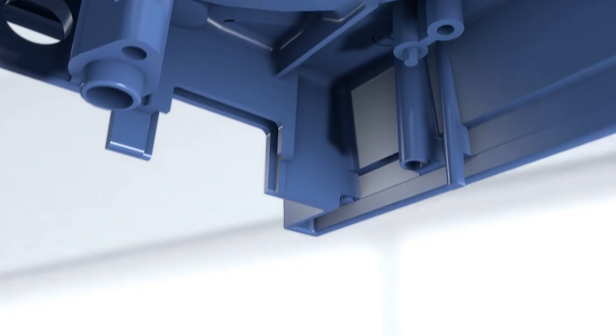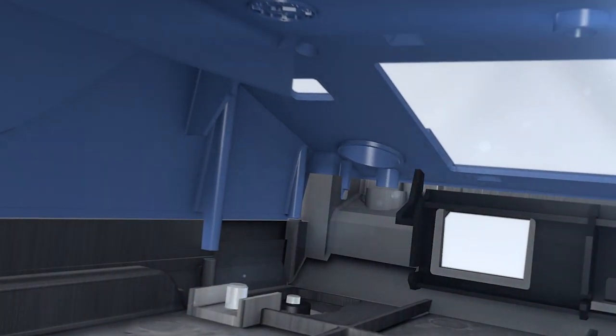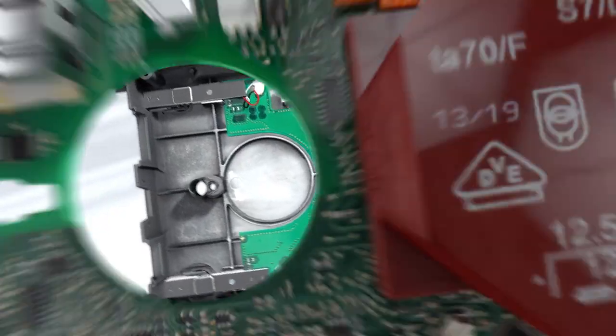A coated and sealed housing protects the motor and display. Focusing on high quality with standardized processes and quality checks. A fully automated assembly process ensures 100% quality control of every PCB.